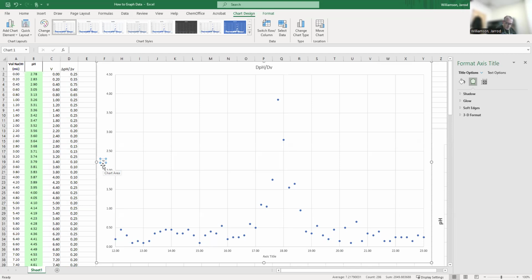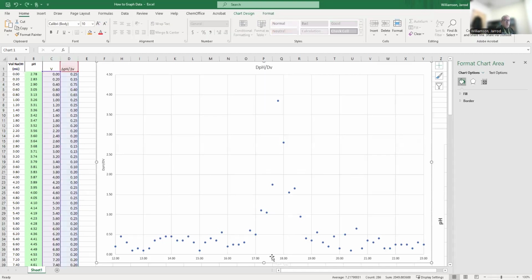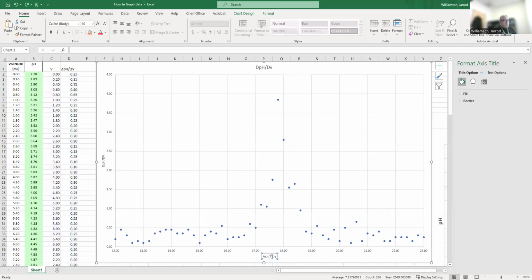Oh no. All right, guys, I messed up today. Delta pH over delta V. This is volume. Let's get rid of the title for now.